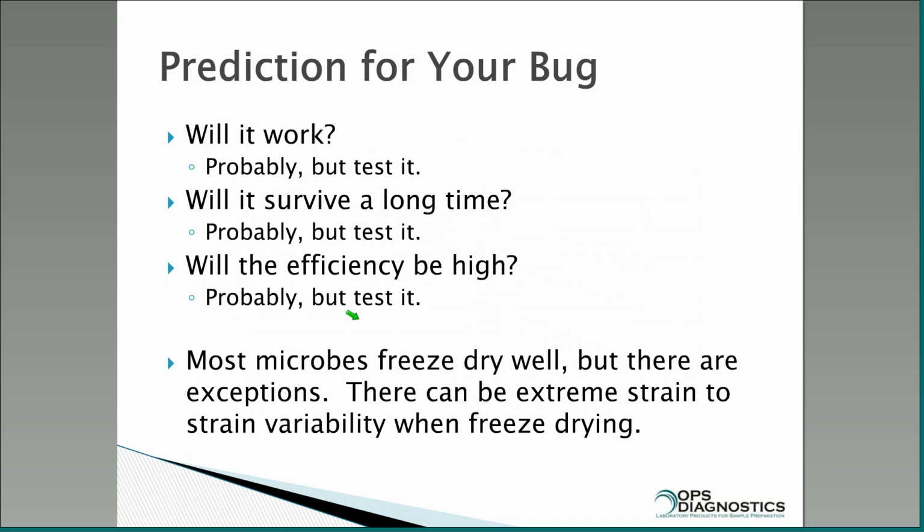Okay, so how's this going to work on the stuff you're working on, which is always what people ask me. I get emails all the time. I'm working with some esoteric organism. Can I freeze dry it? Yeah, you can freeze dry it, but I'm not sure if it will be alive. And the bottom line is that every strain is different, and that's a horrible answer, but it's a true answer. So, if you need to freeze dry something, will it work? And the answer is probably. Most of the stuff that we freeze dry goes without a hitch. But bottom line is you got to test it. And the same thing goes with how long will it last, and it'll probably last a long time, but again, you got to test it. And will it be efficient?